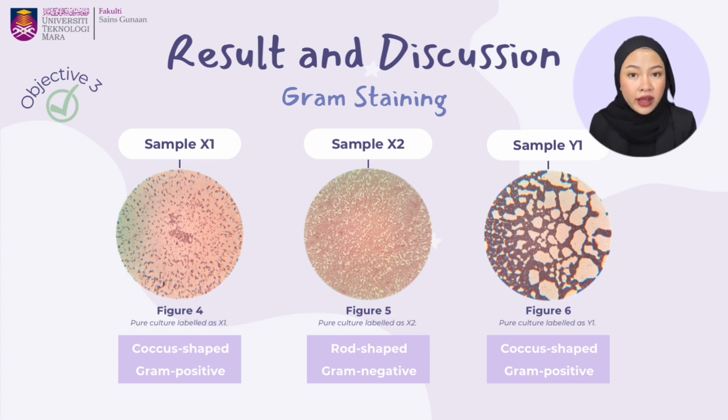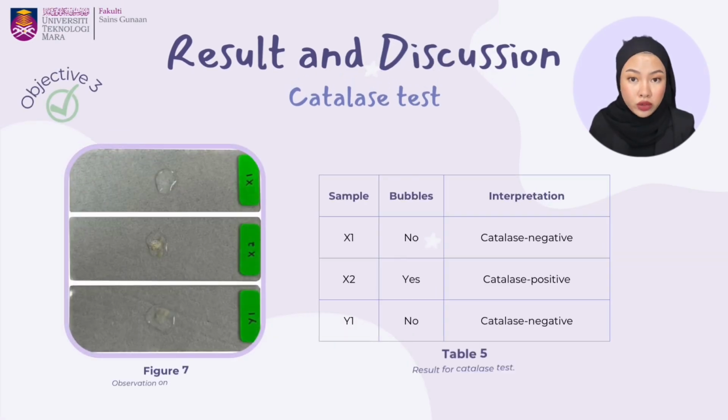According to Oliveira et al. 2022, there are several types of rod-shaped gram-negative bacteria, most of which are grouped under the family of Enterobacteriaceae, such as E. coli, Salmonella, and Enterobacter aerogenes. In order to distinguish between Staphylococcus and Streptococcus species, catalase test was conducted. According to CBT 2020, Staphylococcus species are catalase positive, whereas the study by Suvarna et al. states that Streptococcus are catalase negative.